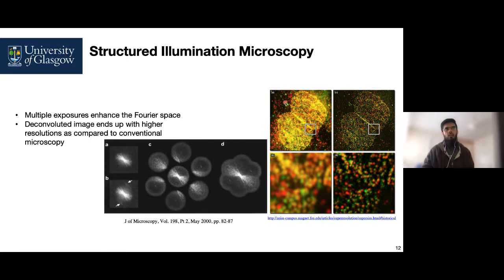In the figure on the left top, we see what we would observe from a conventional microscope, and the figure on the right top is the one we would observe through SIM, which is short for structured illumination microscopy.